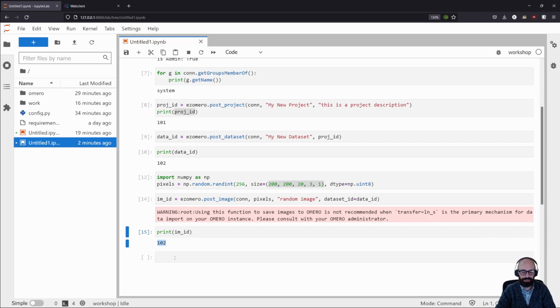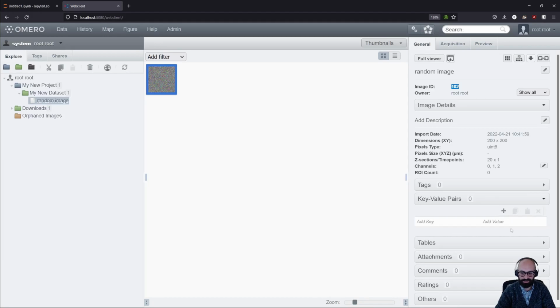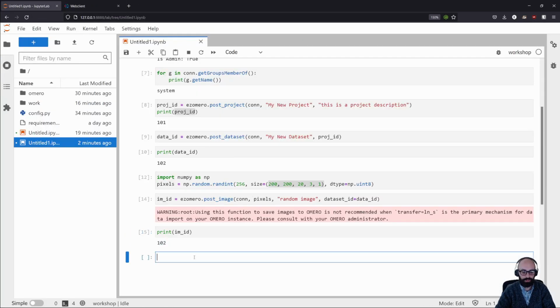One thing to note is that if you want these annotations to be editable from the OMERO web interface here, they need to have a specific namespace that you need to use. We're not going to be using the specific namespace. I recommend, again, check the documentation if you're interested in that specific thing. We're just going to be using a namespace I came up with.